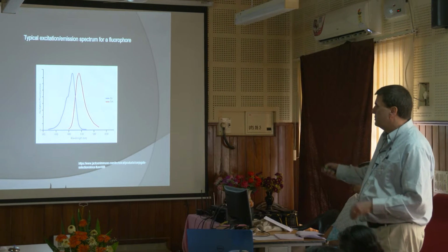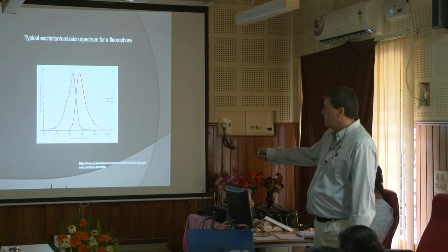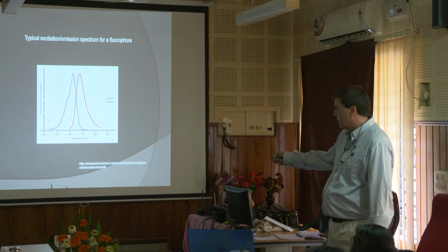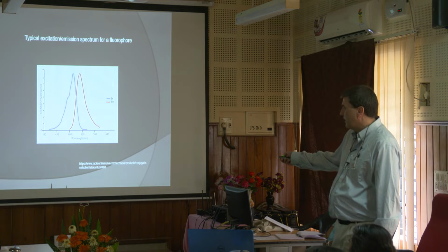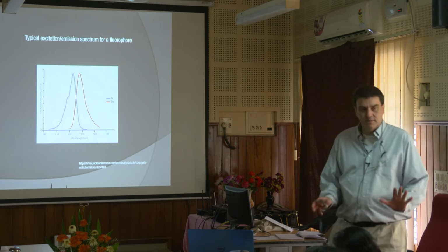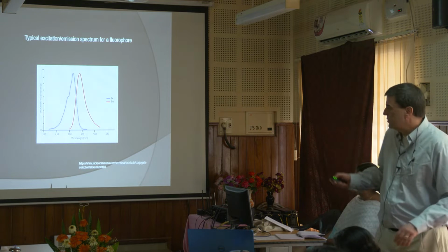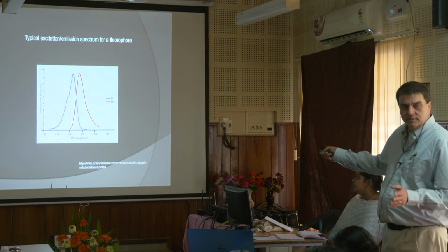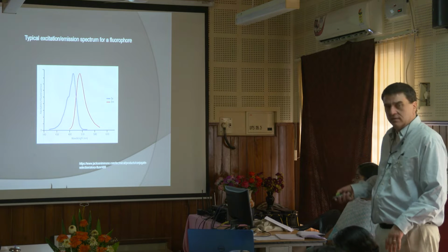So if we put Roy G. Biv up here, V would be down here and R would be up here. So it'd be like Roy G. Biv, okay? So this is the green area. That's why this is a green fluorescent molecule, okay? Does this all make sense so far? The Stokes shift would actually be between these two, the difference between the emission and the excitation, okay?